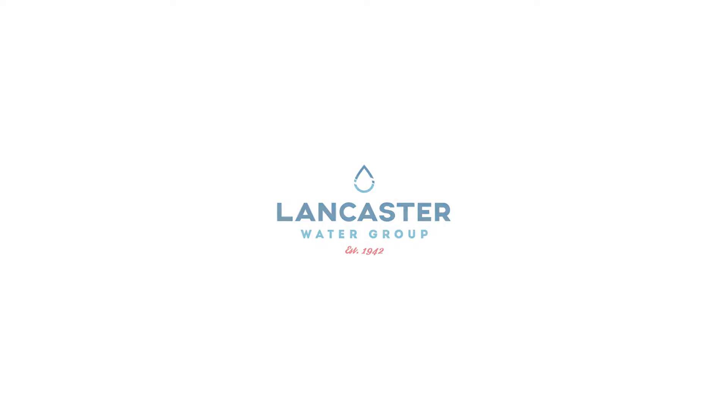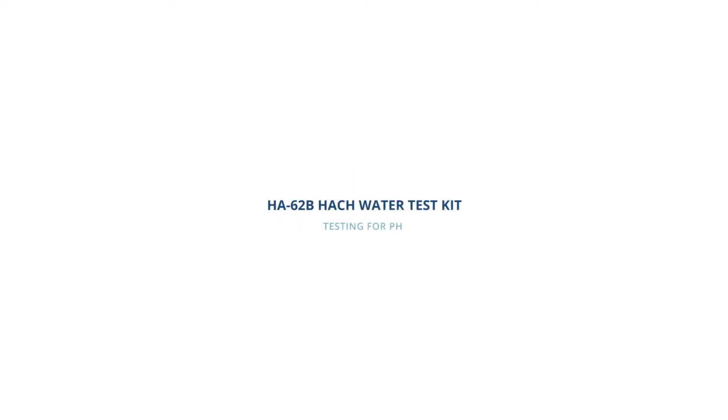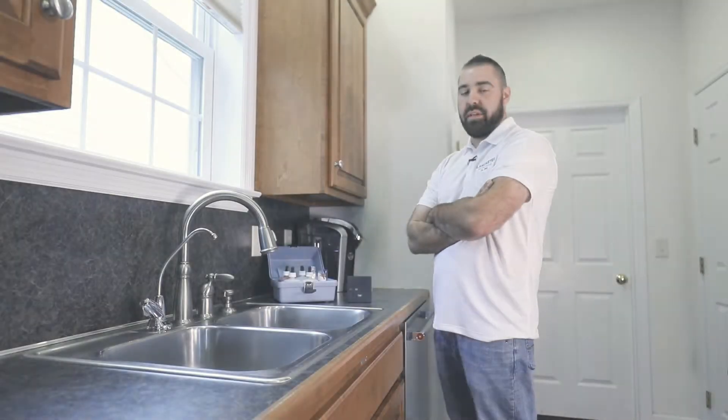Today at Lancaster Water Group, we will be discussing how to test for pH using the Hach HA62B kit that we sell.